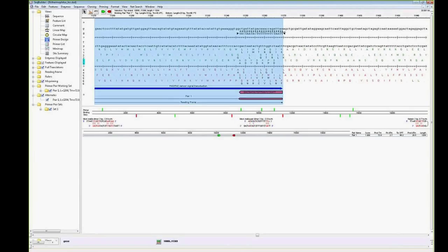In this case, I want to keep the default primers because we really did get good quality primers with the default options. You can also introduce restriction sites for restriction cloning or codon changes. Again, just if you want to avoid any dimers or hairpin problems. So I have my PCR primers, and now I want to simulate amplification of the PCR product.